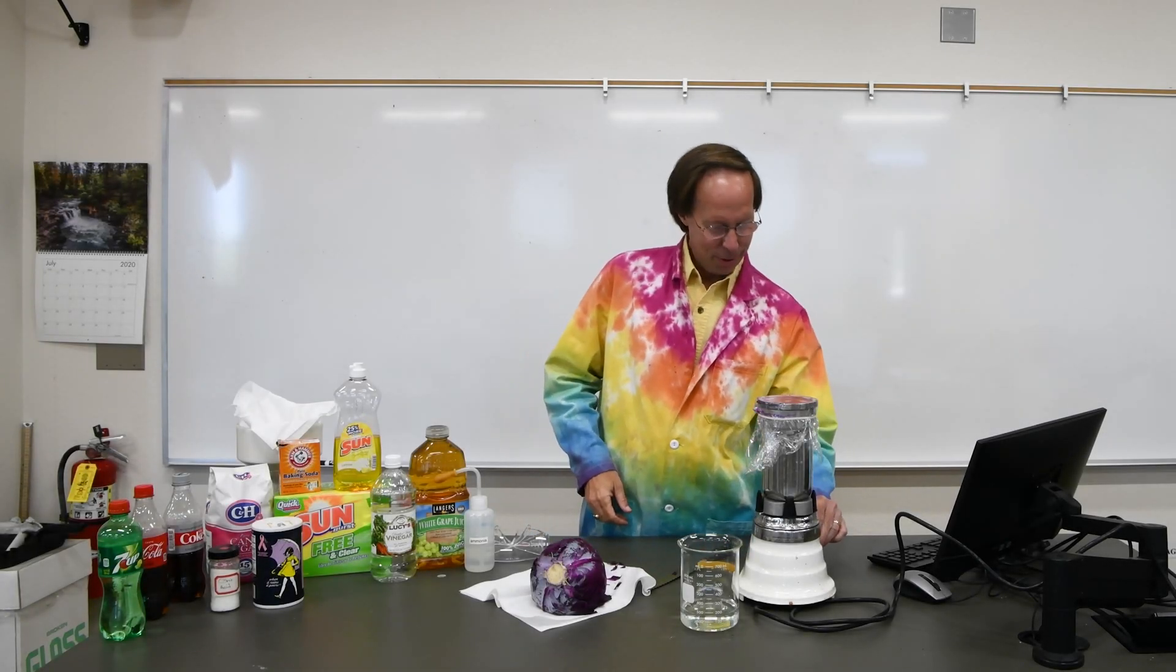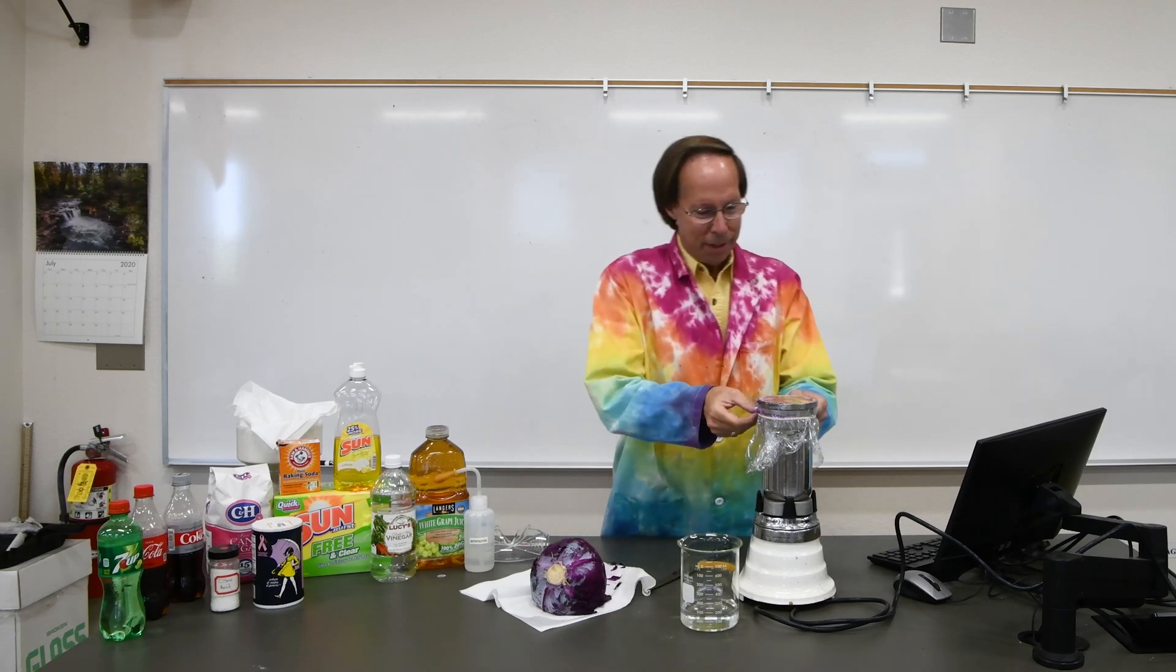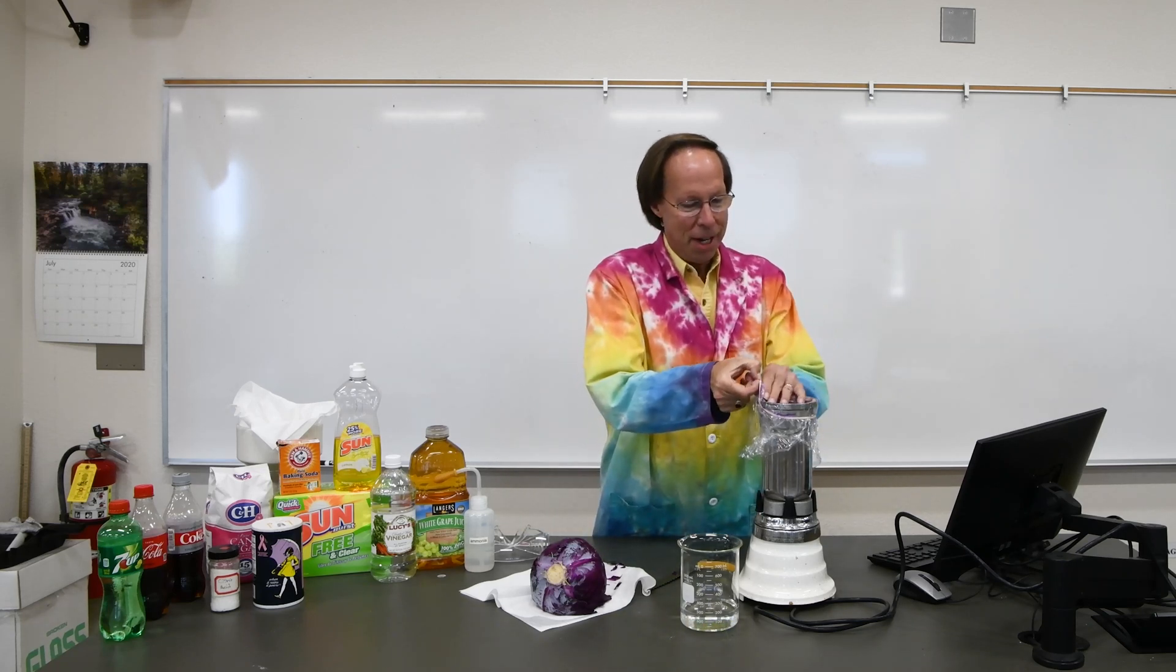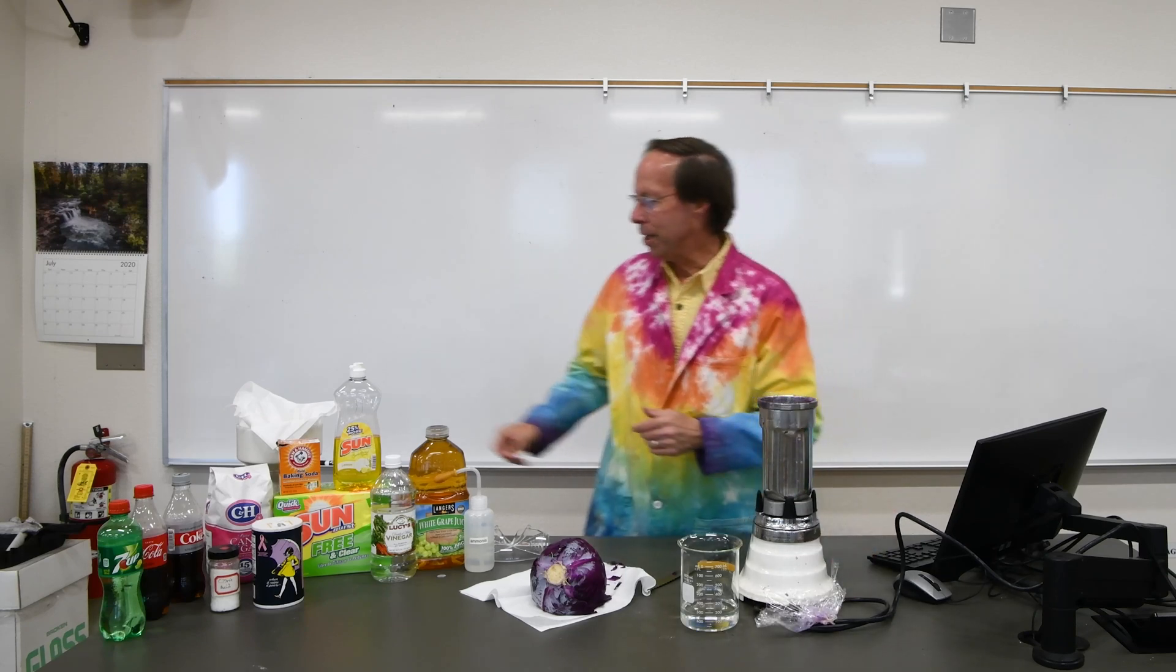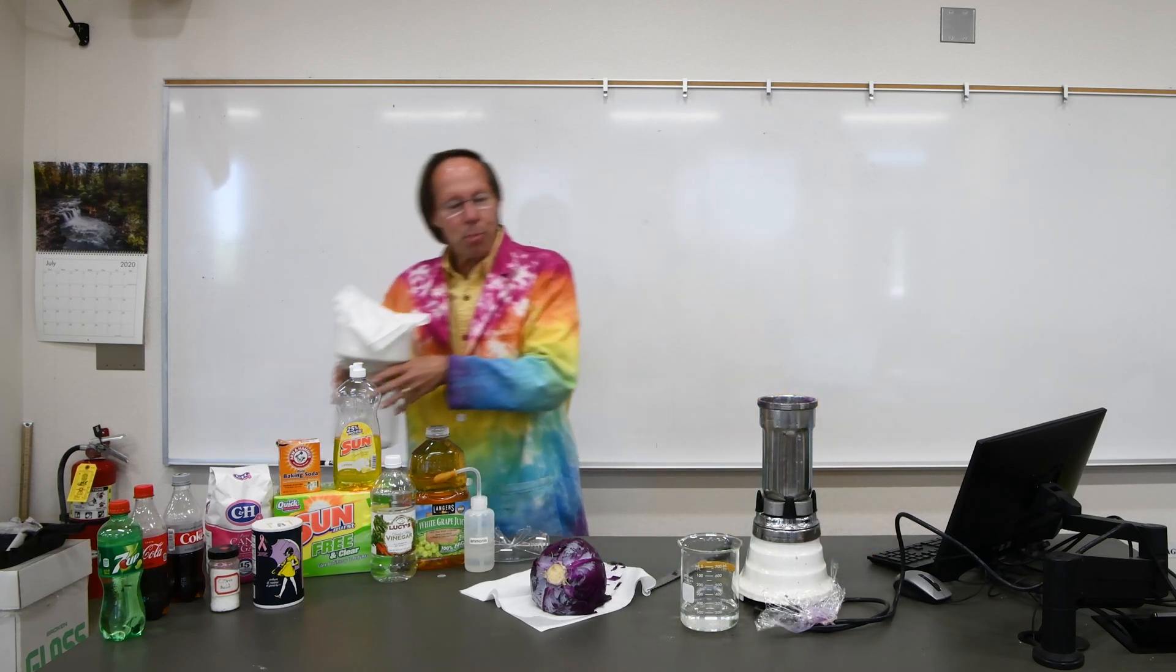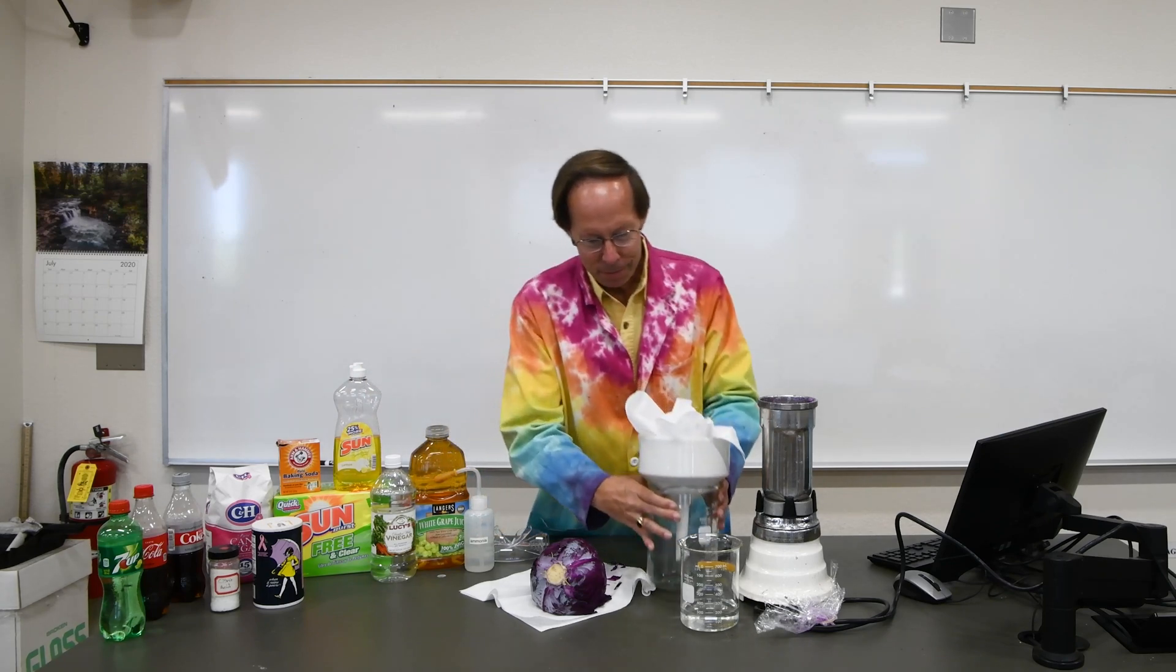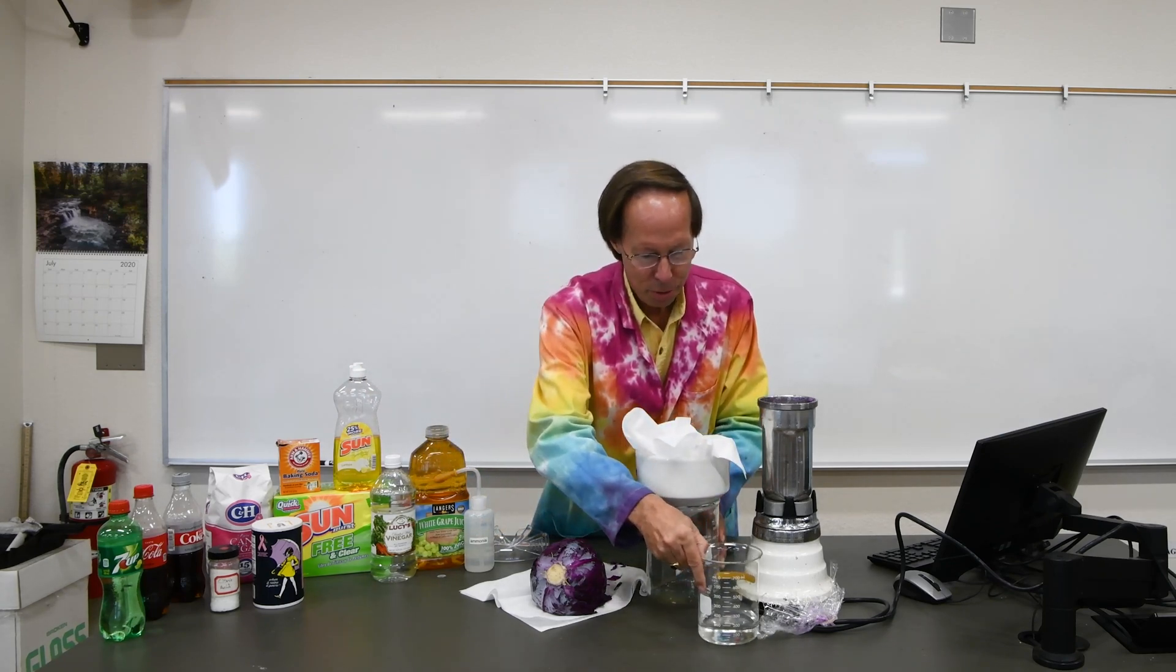All right, I think that's enough. Let's turn that off. It's pretty noisy. Now we have this lovely cabbage juice slurry in here. Looks like a purple smoothie. We're going to have to remove the cabbage solids from the juice. So to do that we're going to use a filter.